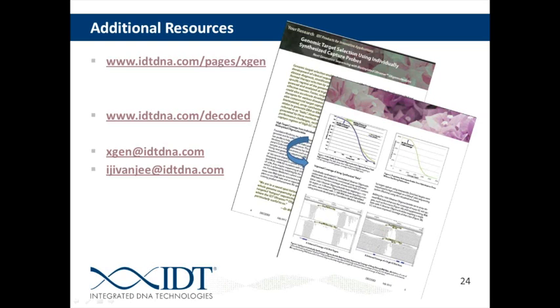Okay. So the next question that I have for you, and Adam, I guess I'm going to go to you with this one as well, is: are there any rules or guidelines as far as the size and type of DNA fragments that you can use the xGen probes with? No, not really. The rules regarding the size and length of the fragments have more to do with the platform that you're using and the actual type of sequencing that you're doing with the platform.